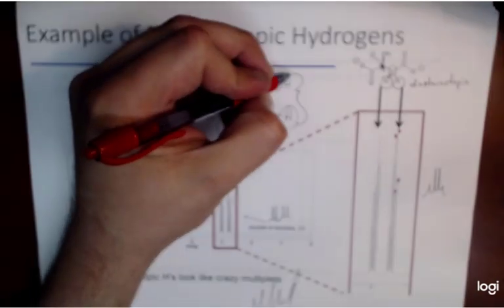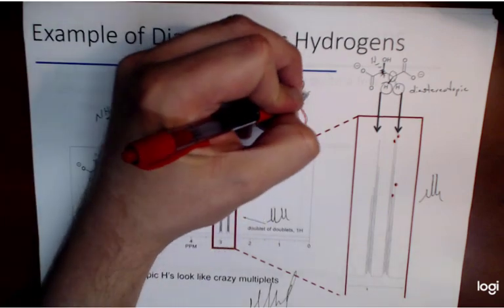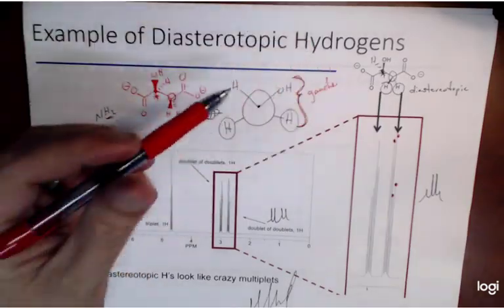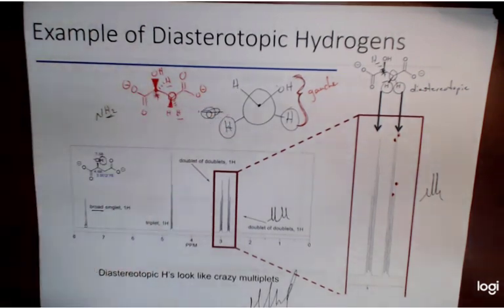And specifically, if you notice, the two wedged species, the OH and the hydrogen, are gauche to one another, while the two dashed hydrogens are gauche to one another. So we know that these gauche interactions in Newman projections do have energy associated with them. That's why we can see how these two gauche interactions are well resolved, because they have a distinctive difference in their energy level, or in their stability, aka energy.